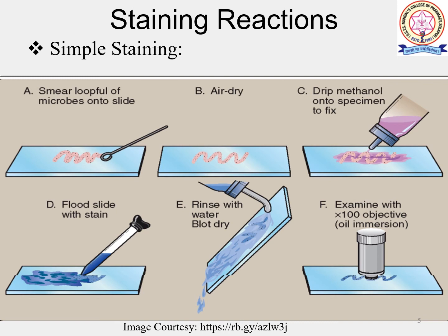Identifying the shape of bacteria helps to eliminate the isolate as a possible contaminant. Whatever species are behaving as contaminants can be identified and isolated easily.